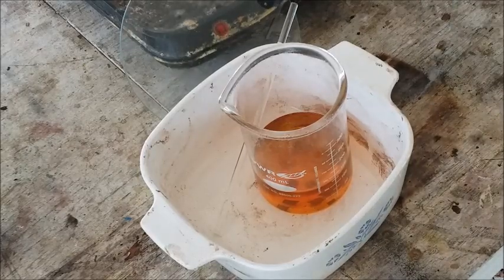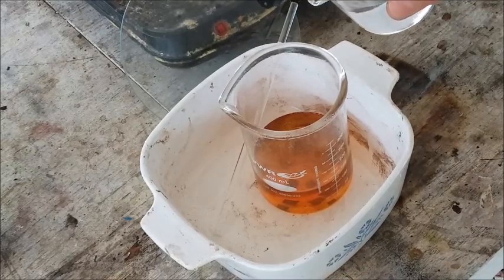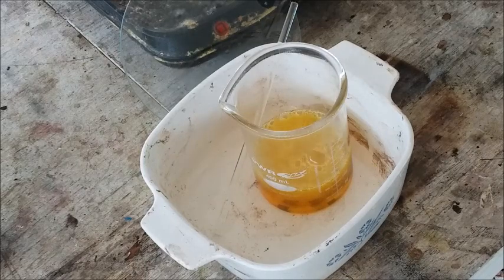I have a saturated solution of sulfamic acid here. I'm going to use it to denox the solution in case there's any excess nitric acid in there. I wouldn't be surprised. I generally put in a little too much. And just put in a little bit here. Oh yeah, we got some excess nitric in there.